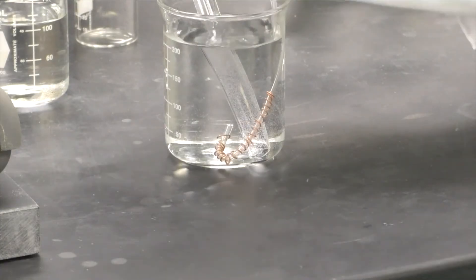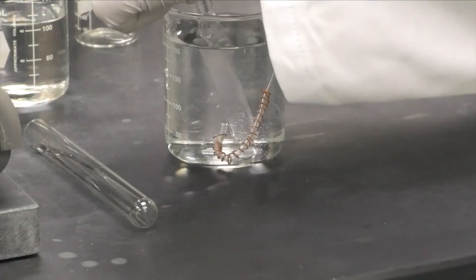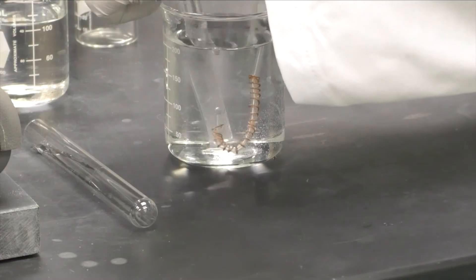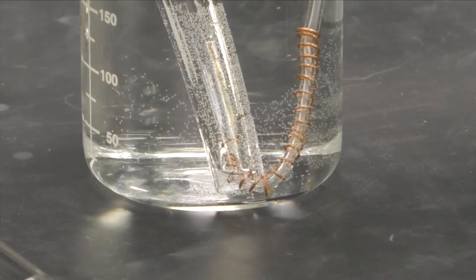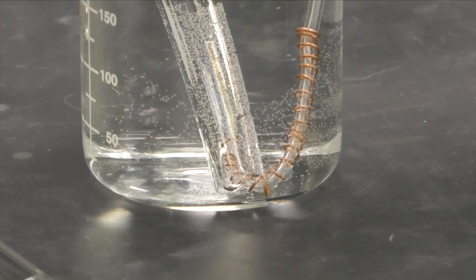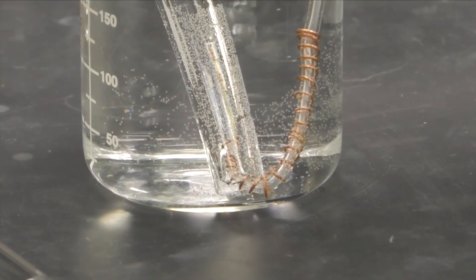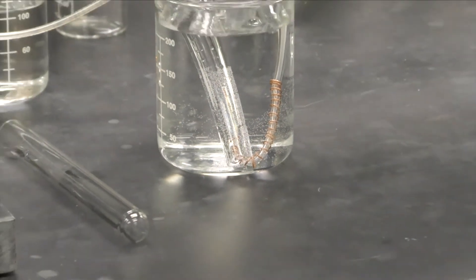Then, carefully lift the gas collection tube and slip it over the end of the Tygon tubing. Let the gas collection tube completely fill with gas until there are bubbles coming out of the glass tube.